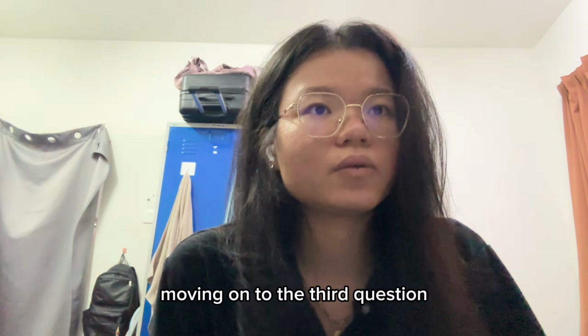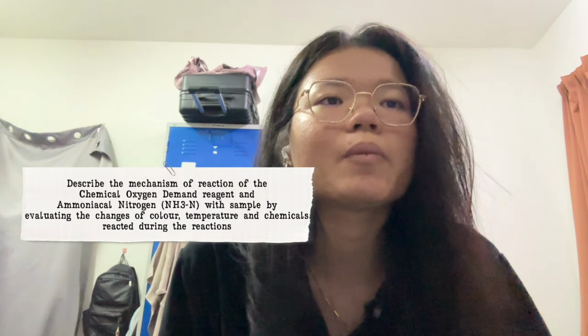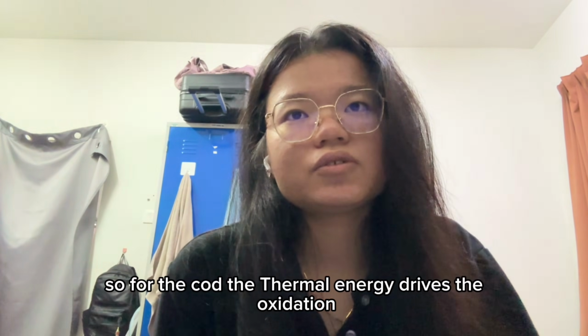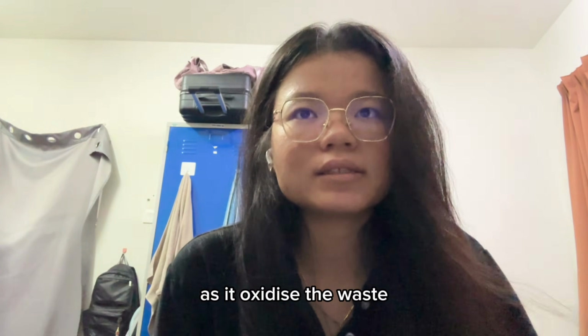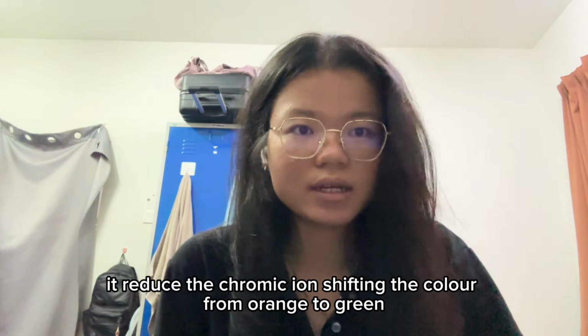Moving on to the third question. Describe the mechanism of reaction of the COD reagent and ammoniacal nitrogen with sample by evaluating the changes of color, temperature, and chemicals reacted during the reaction. So for the COD, the thermal energy drives the oxidation of organic waste by potassium dichromate. As it oxidizes the waste, it reduces the chromic ion, shifting the color from orange to green.